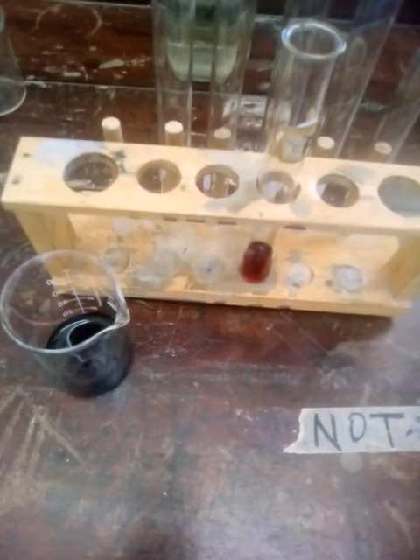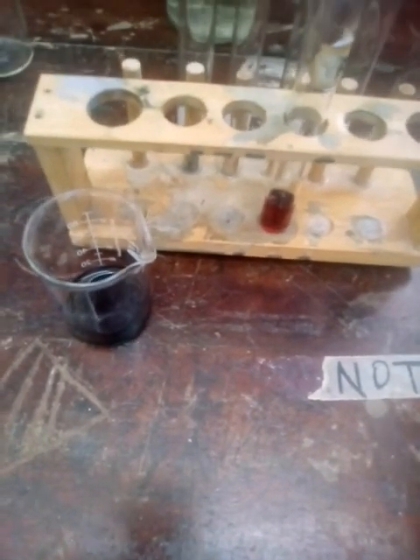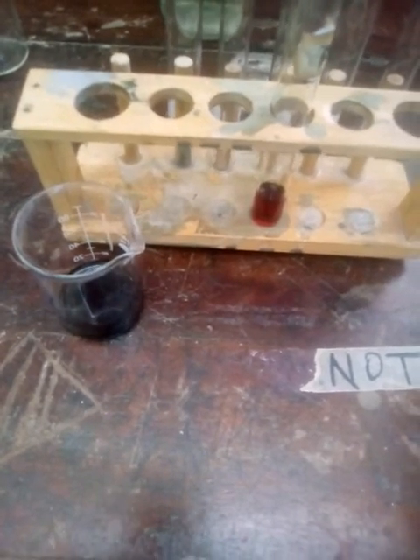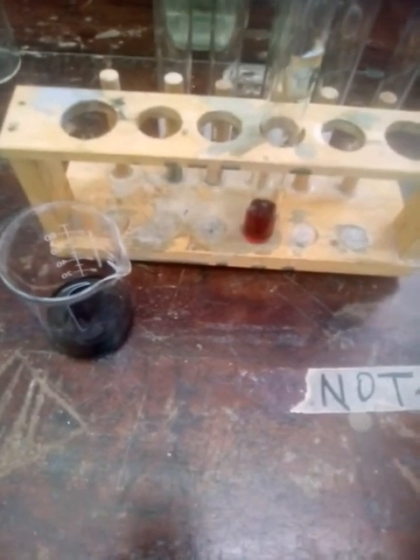Hopefully you guys learned something again today about redox reactions. Always remember, in a redox reaction there is one reagent that is the reducing agent, and one that is the oxidizing agent. There was an oxidizing agent in this reaction, and there was also a reducing agent.